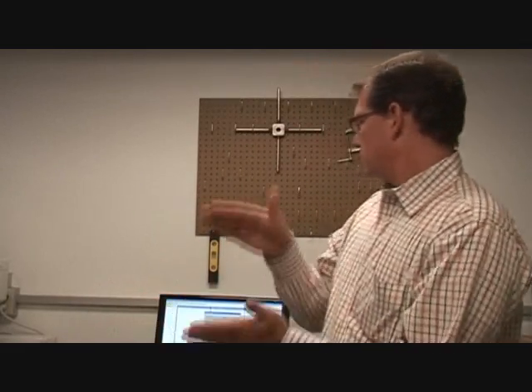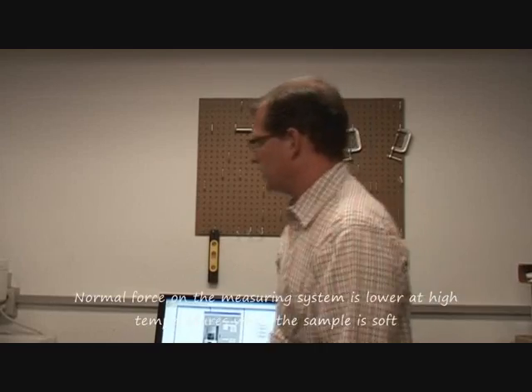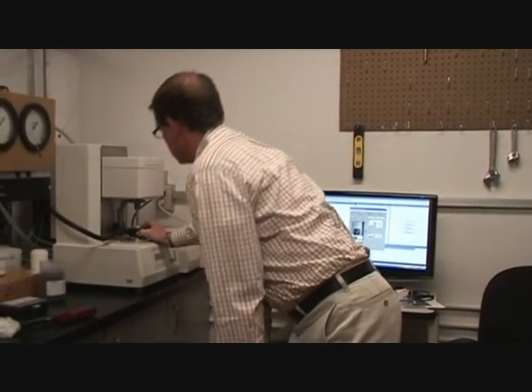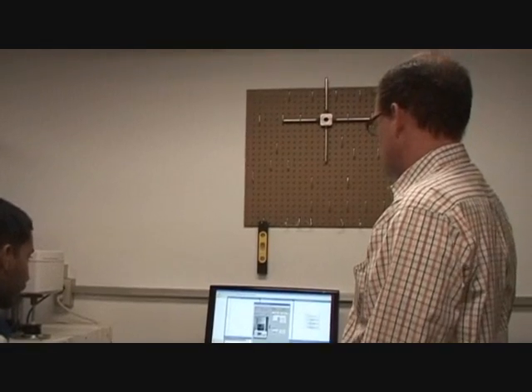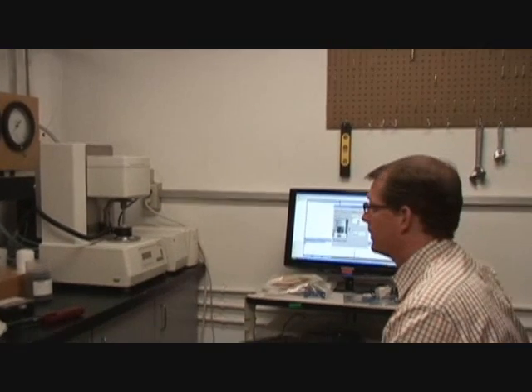These tend to expand or contract — I can kind of see this, and I like to see it here. My normal force — that's the force pushing back up on it — it's lower at higher temperature. Nice and soft there. But as I go to lower temperatures, it gets harder. I'm going to play around a little bit. This is what we're going to do to kind of figure out how to run this one.